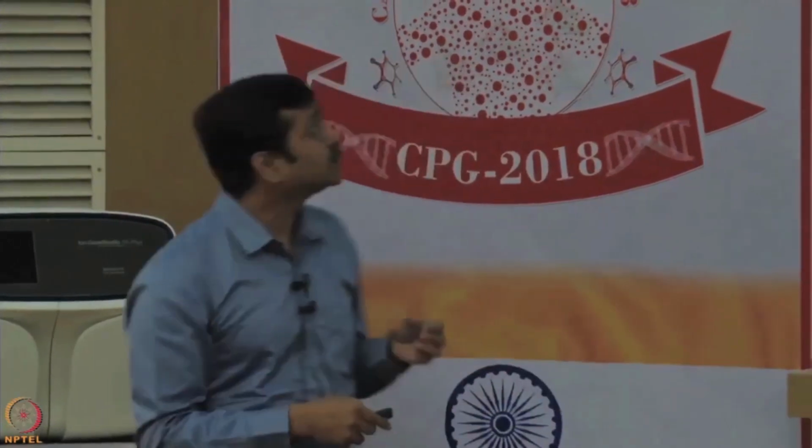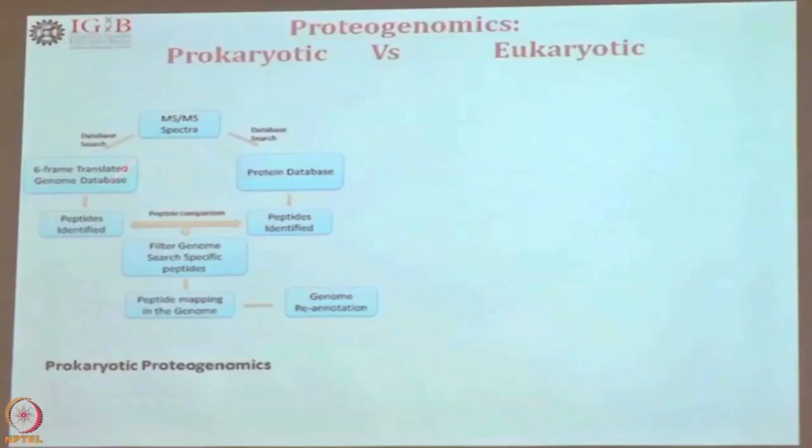But the main problem was to identify proteoforms. So, how do I now get the proteoforms? We have created a translated transcriptomic database. We have now created multiple algorithms and are rationalizing the results from them. Now, can we have an end-to-end solution for a mass spectrometry person coming with data to do proteogenomics? To do that, we needed a bridge, and we constructed this bridge.